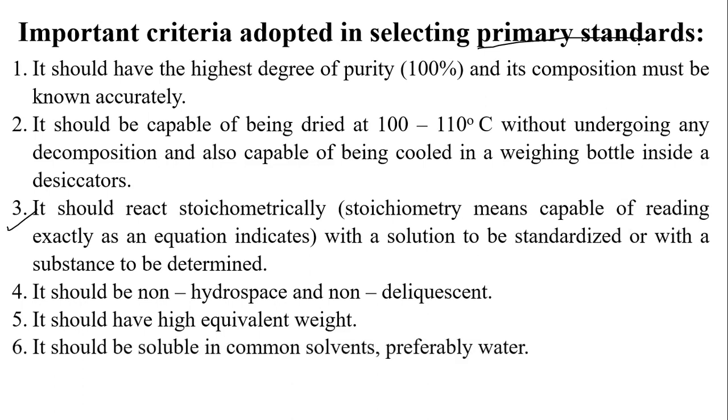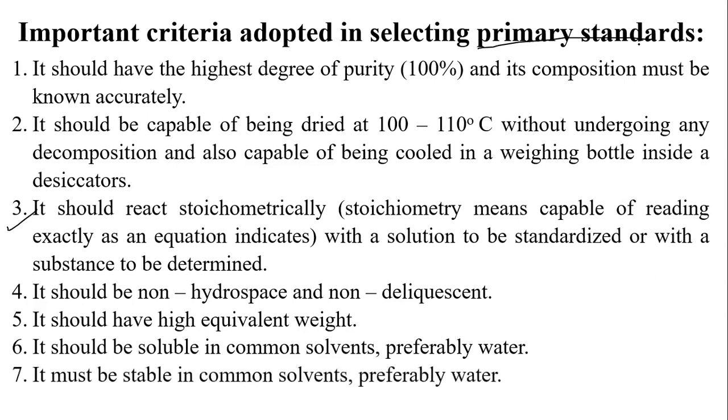And coming to the sixth one, it should be soluble in common solvents, preferably water. Generally in soil science, we prepare all our solutions in distilled water. If you want to be very cautious, double distilled water is preferred for preparing primary standards. And all the normality, formality, all these types of solutions should be prepared in a volumetric flask only, not in beakers or any other container.